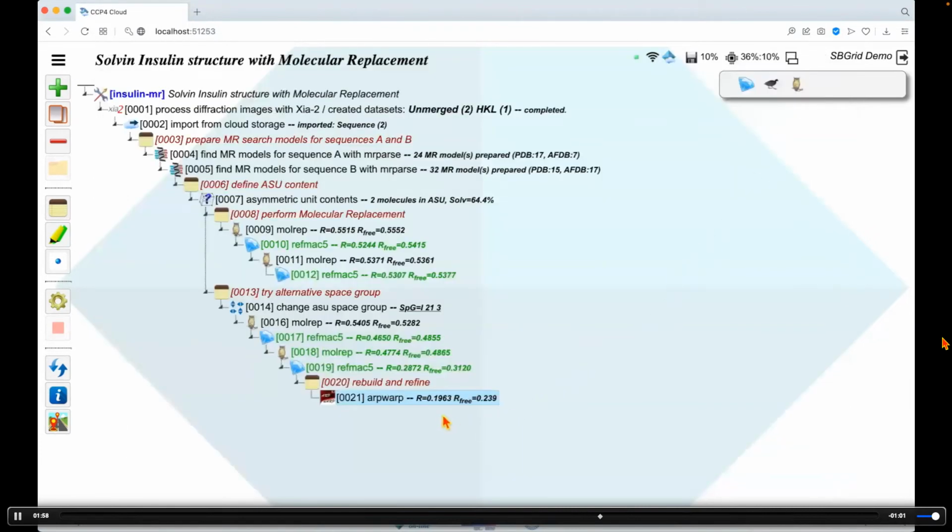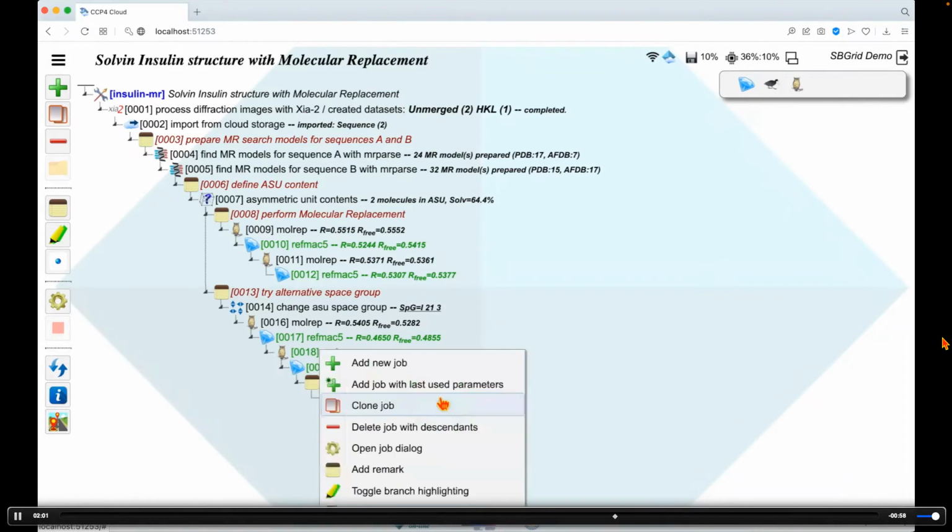So now you want to further improve the build, and if you're good with RefMac, you can do it all manually, just run RefMac with the right parameters or adjust parameters. Again, this can be done, but it's a little bit tedious, and therefore I now prefer the refinement and ligand fitting workflow, which usually does a pretty good job.